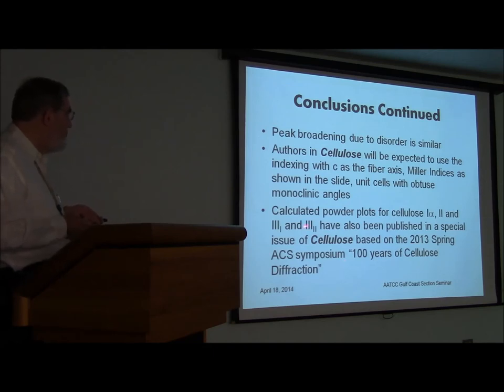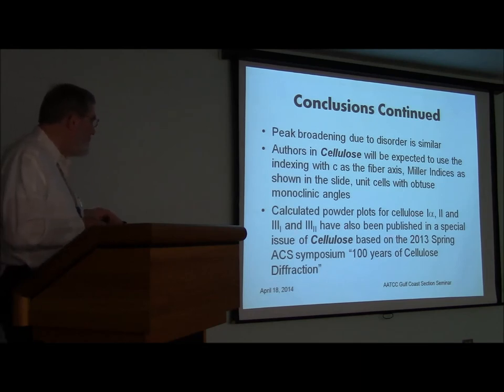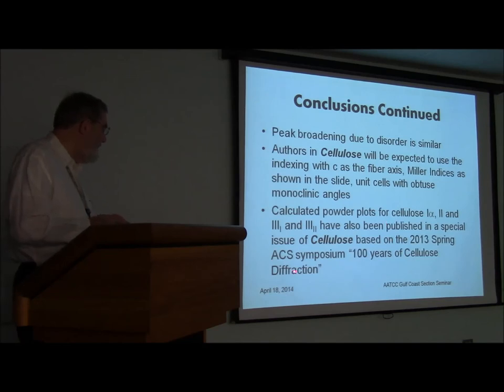And we've done the calculated plots for all the other polymorphs that crystal structures are known for, and they've been published in another issue of Cellulose that just came out.